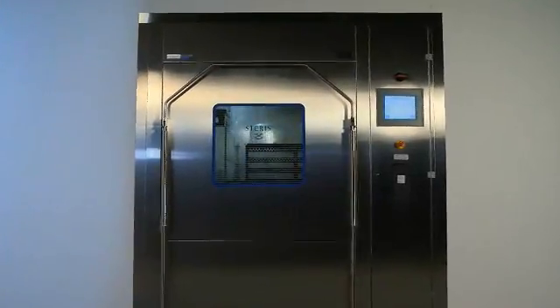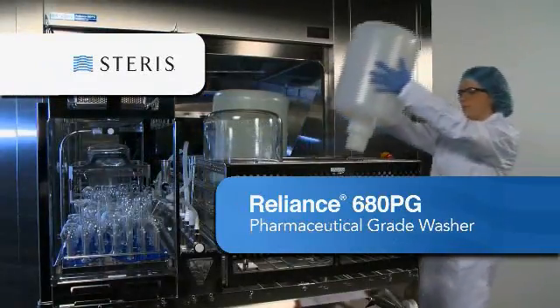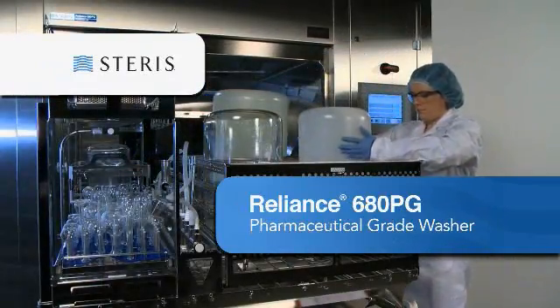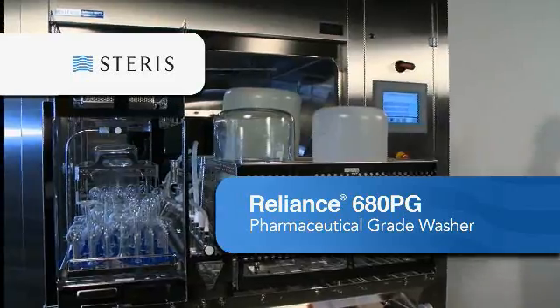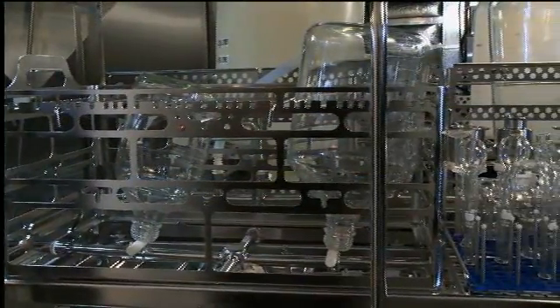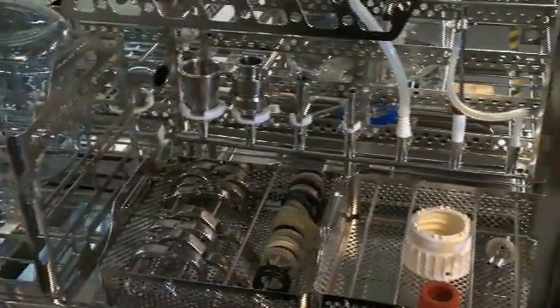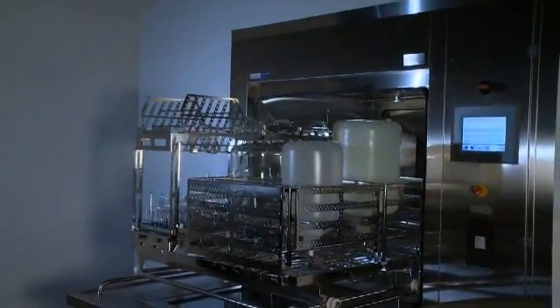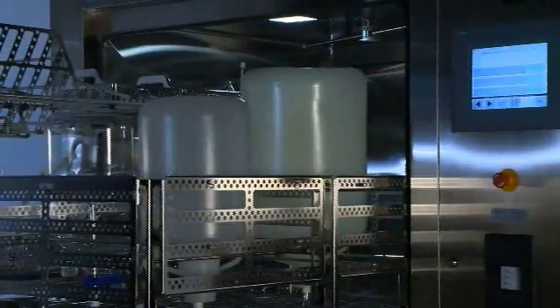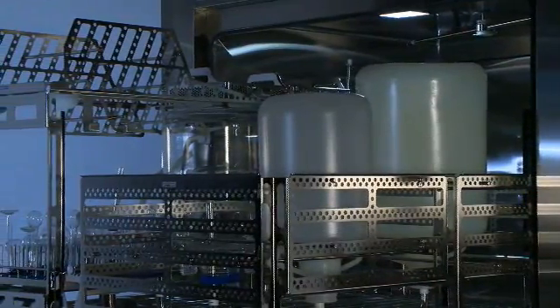Introducing a new high-performance parts cleaning system from Steris. The Reliance 680PG Pharmaceutical Grade Washer was designed to clean critical components commonly used in pharmaceutical manufacturing, such as filling line and packaging machine parts, tanks, containers, glassware, and more. This advanced washing system offers several innovative features that help deliver consistent cleaning results in applications where current good manufacturing practices apply.